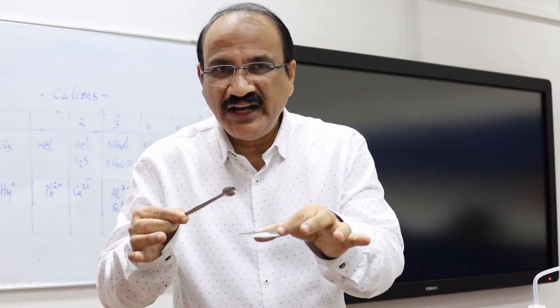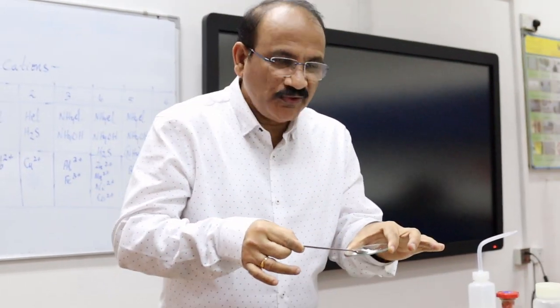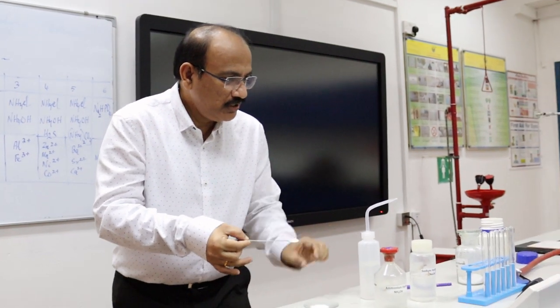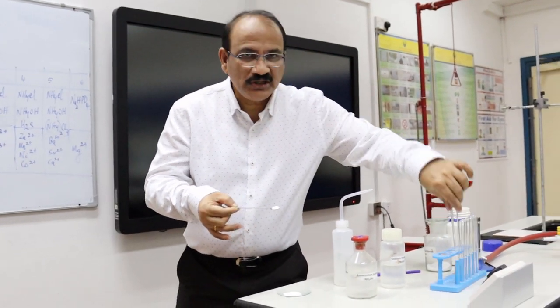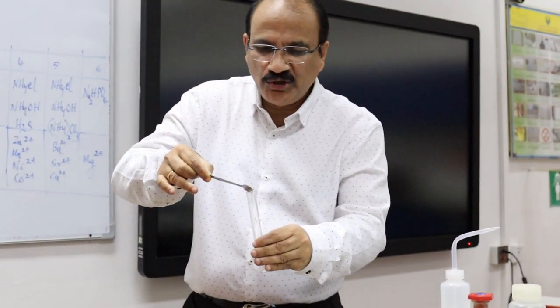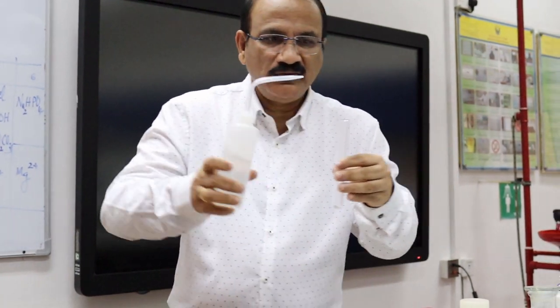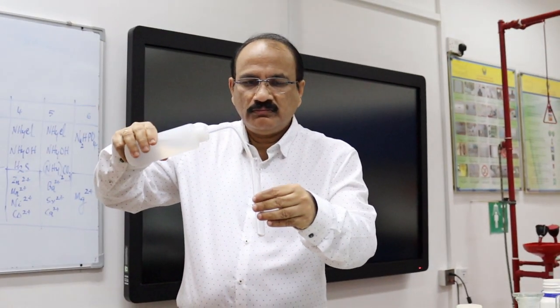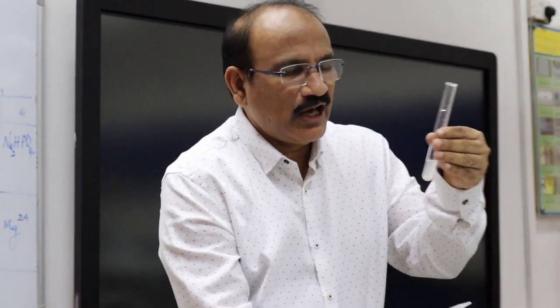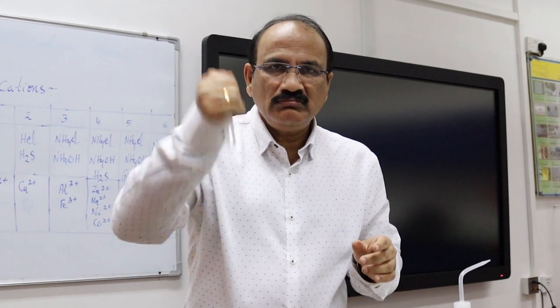Let us identify the group. For that, we will take the salt and put it into a test tube and we will make a solution with water. This is aluminium salt solution.